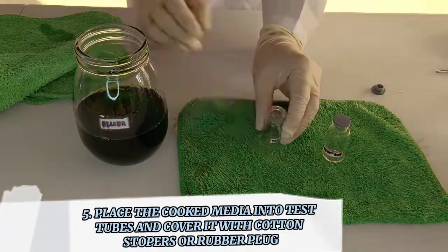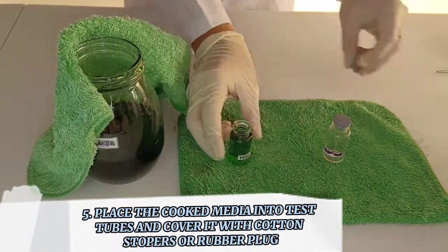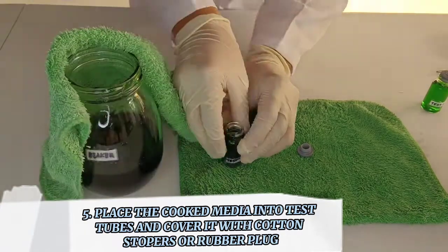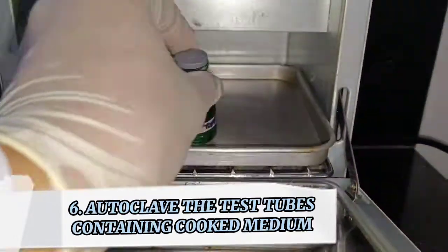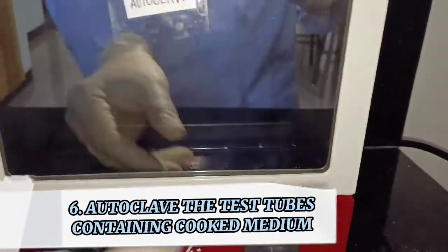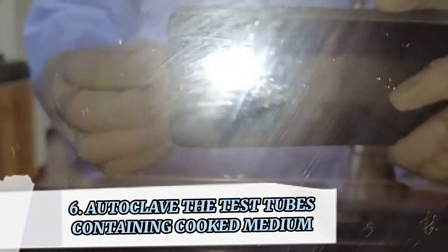Place the cooked media into test tubes and cover them with cotton stoppers or a rubber plug. Autoclave the test tubes containing cooked medium at 121–134 degrees Celsius for about 25 minutes. Afterwards, we have our prepared culture medium.